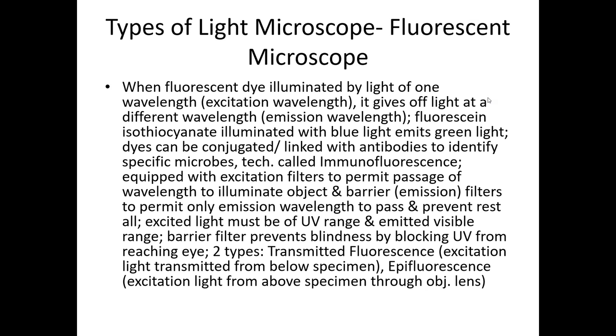In the beginning, I have explained each and every term. That's why I explained in the beginning: reflection, refraction, dispersion, fluorescence, refractive index, everything I explained, because I know when we start learning microscope, all these terms will come and then you will get confused. That's why. Illumination, no, Prema Kumari, your answer is not clear.